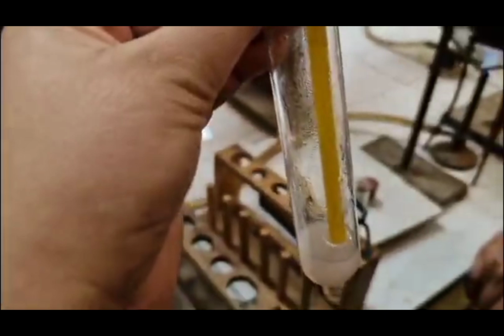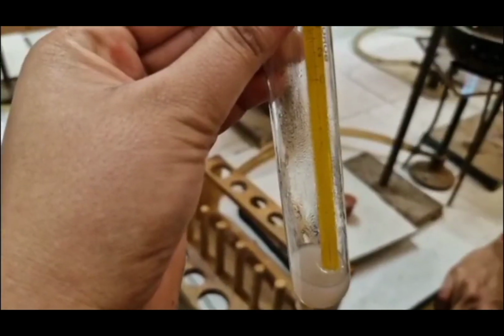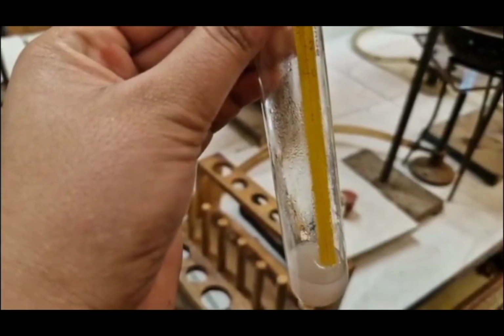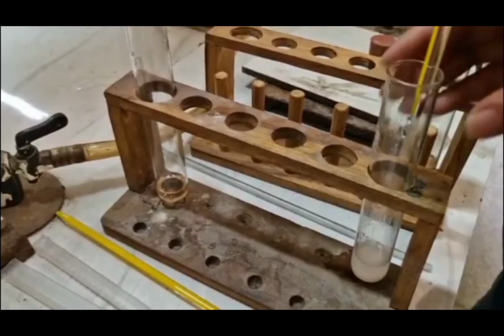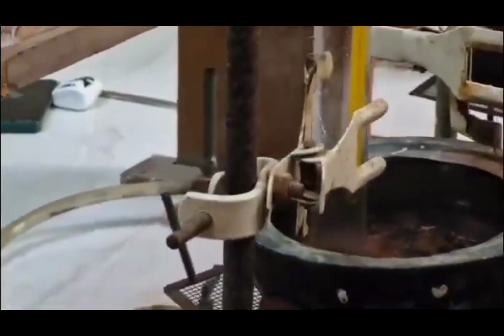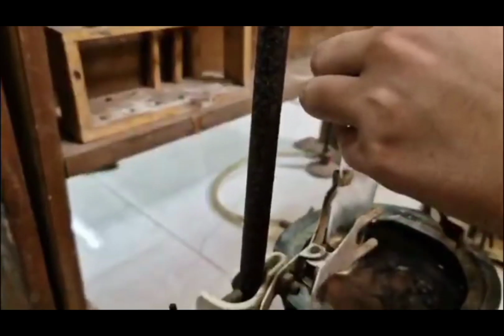Now in our phenol water system, turbidity appears and note down that temperature. Now we will add 2 ml more water and we will again heat it and note down the temperature when turbidity disappears.